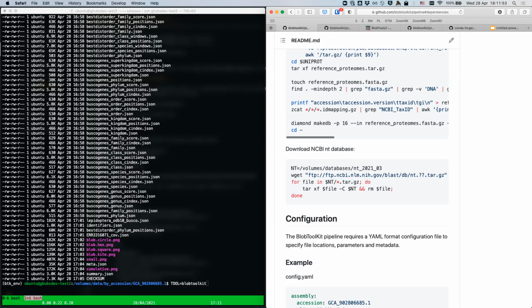So in the tutorial, there will be a minimal config.yaml file, and there will be a minimal BLAST database and a minimal Busco lineage, and everything that you download should work. And then it's a question of you expanding it. So you get the full BLAST database, you get the full Busco lineage, you get the full everything, and then everything should work. That's the idea. Cool. Any other questions? Oh, what is the basis for setting up e-value cutoff?